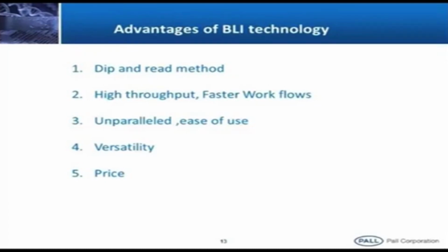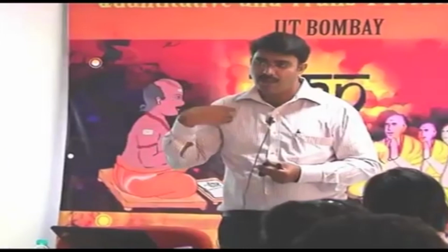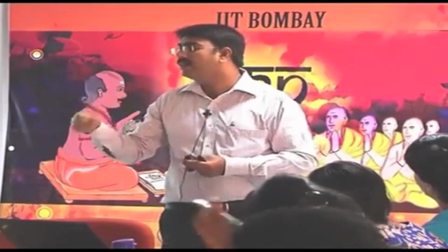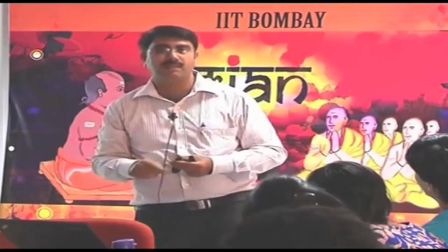In the case of SPR, it works on the principle of microfluidics. You know in HPLC there are pumps, peristaltic pumps, that deliver the mobile phases. In SPR also, there are buffer systems that deliver the mobile phase or the buffers on the sensor surface. So in microfluidic devices, we can't use crude samples, for example serum sample analysis, body fluids, or samples from the bioreactor itself, because they contain many contaminants and block the flow cell. Once the flow cell is blocked, we have to replace the complete assembly. That is what makes SPR microfluidic devices expensive.